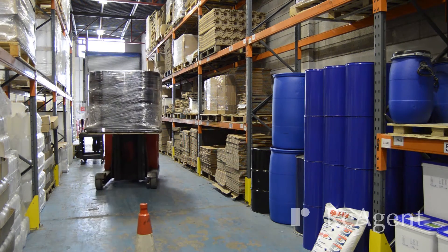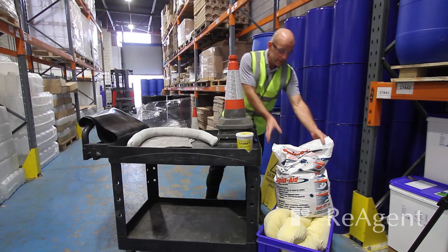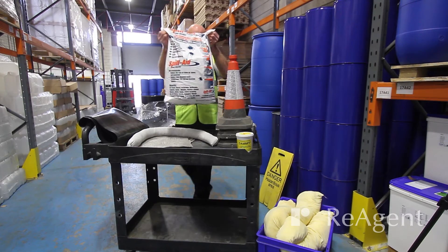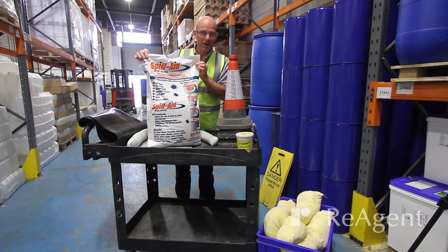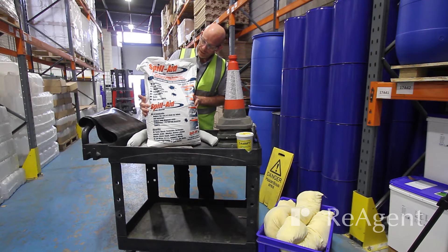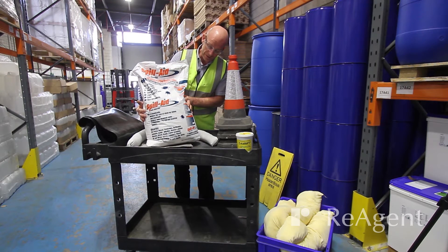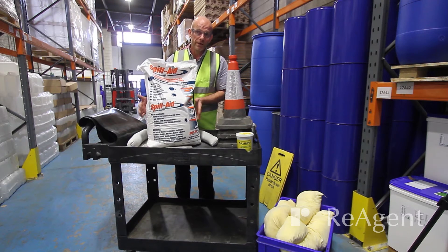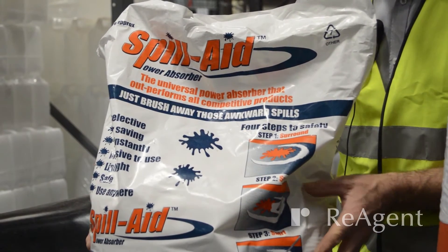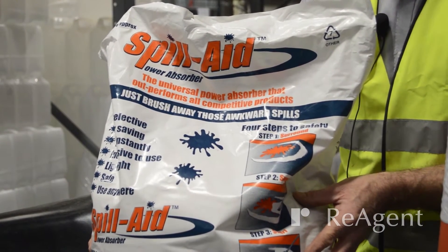The last absorbent we have comes in 30-litre bags. The one we use is called Spill Aid — it's just the one we buy. It has a very high capacity; one bag would probably absorb a couple of hundred litres of liquid. It's suitable for most things: acids, solvents, and alkalis. The only thing we can't use it for is hydrofluoric acid, for which we'd need a different absorbent.